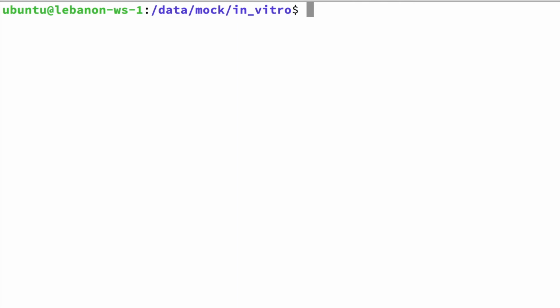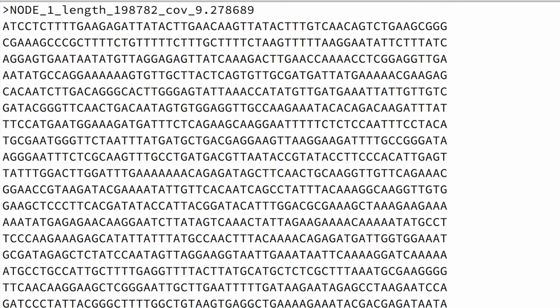Let's now have a look at the output of the assembly, the contigs. So, I decided to save the output in my home. In SPAdes, you will see in the note that there is an assembly elsewhere in the data directory, but you can just follow the notes without hurdles. So, yeah, this is the multi-FASTA file with the contigs. Each contig has a name, like node 1, 2, and 3. There is the length in the name and the coverage. That is the k-mer coverage.